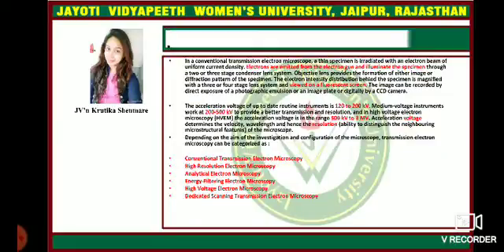In a conventional transmission electron microscope, a thin specimen is irradiated with an electron beam of uniform current density. Electrons are emitted from the electron gun and illuminate the specimen through a two or three-stage condenser lens system. The objective lens provides the formation of either an image or a diffraction pattern of the specimen. The electron intensity distribution behind the specimen is magnified with a 3 or 4 stage lens system and viewed on a fluorescent screen. The image can be recorded by direct exposure of a photographic emulsion or an image plate, or digitally by a CCD camera.